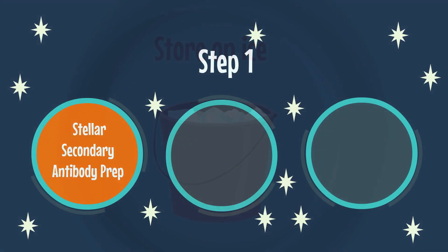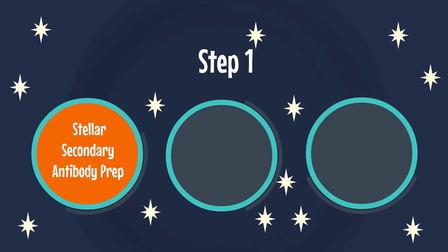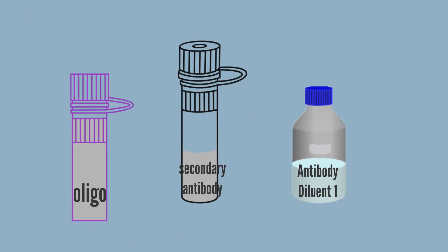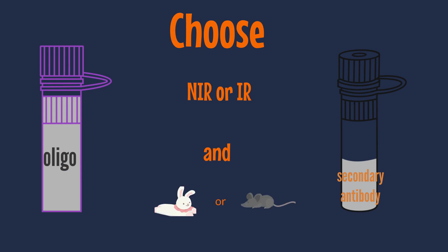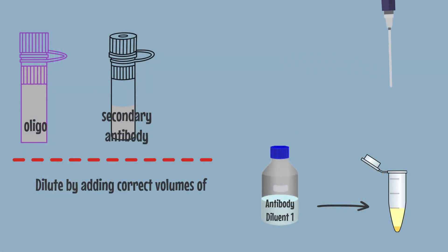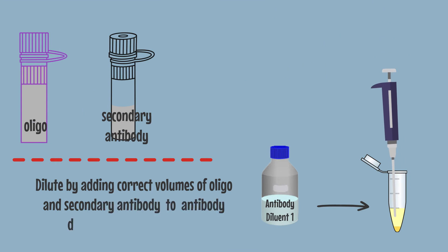Step 1: Stellar Secondary Antibody Prep. You will need Oligo Secondary Antibody and Antibody Diluent 1. Choose NIR or IR, and Rabbit or Mouse. Dilute by adding correct volumes of oligo and secondary antibody to Antibody Diluent 1 in a separate tube.